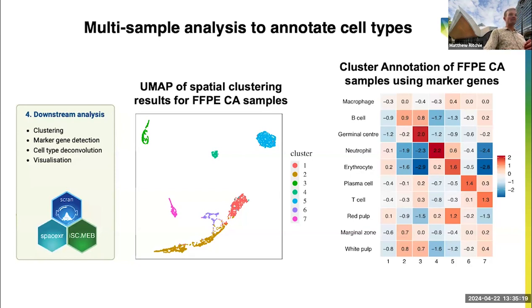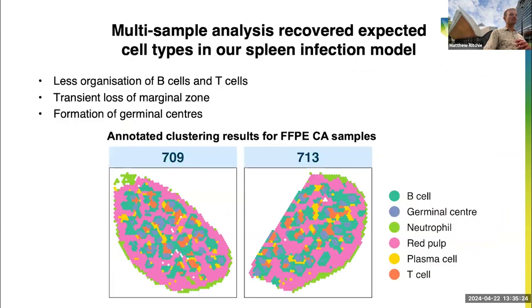That's already very informative. We are seeing the right types of cells in these spleens. And when we plot these results, we can see the tissue architecture. So indeed, you've got little blue spots throughout the tissue. These are the germinal centers, surrounded by clusters of B cells with patches of T cells nearby, just like appeared in the original image.